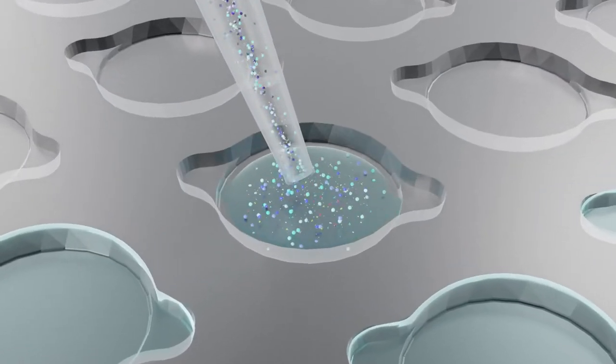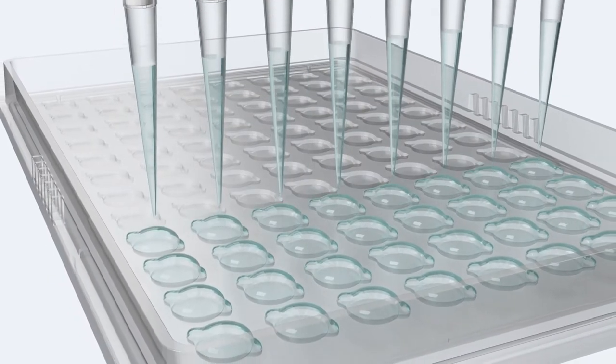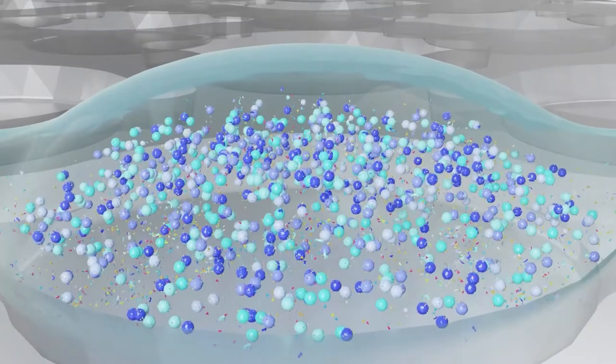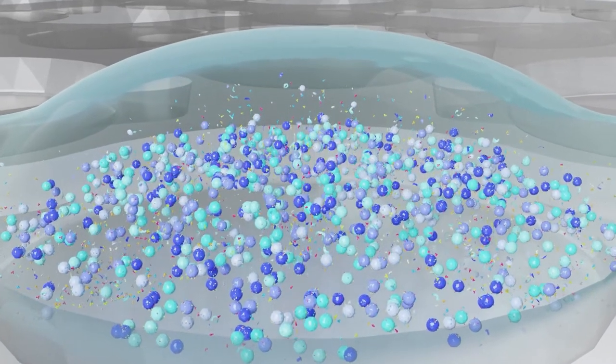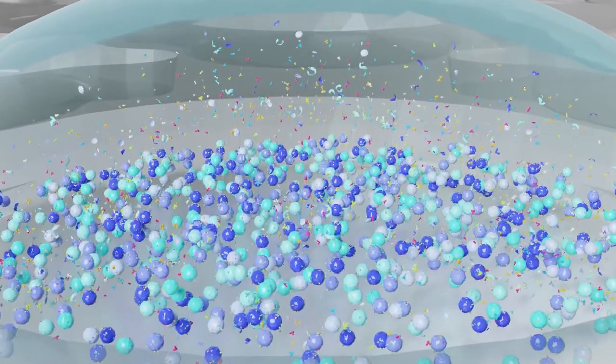Samples ranging from a single cell up to approximately 10 million cells in a buffer are dispensed onto the plate using manual or automated pipetting systems. Gravity then causes the cells to fall to the bottom of the wells where they settle gently on the hydrophilic coating without any physical attachment.